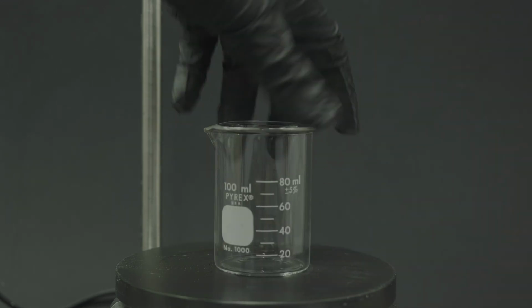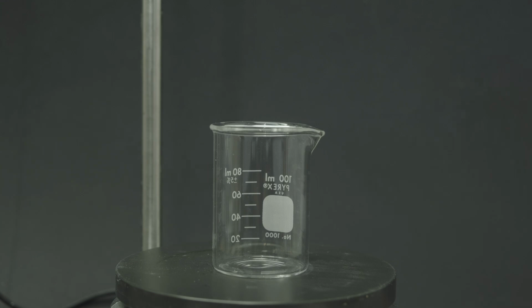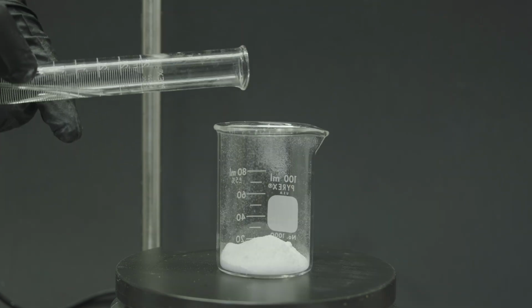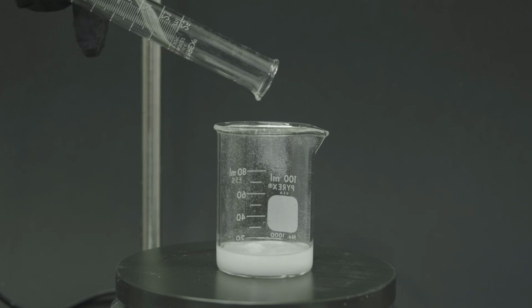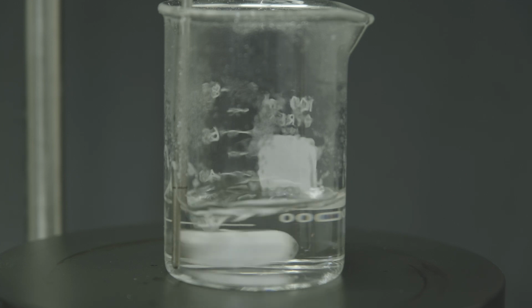I was getting a little bit frustrated at this point, so I got a small beaker, threw in all the ingredients that I needed, 5 grams of salicylic acid, followed by around 10 milliliters of acetic anhydride, and put it into stir. Once I had everything nice and dissolved and the stirring was going good, I just needed to let it sit.